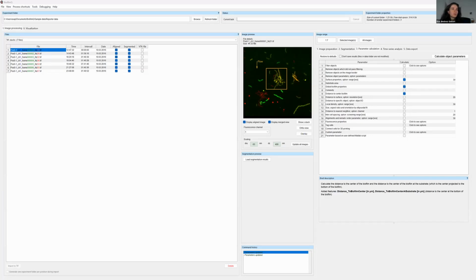You can, of course, do some deconvolution. There's software for that, for example Huygens, where you can counteract imaging artifacts of your microscope. And there are also pipelines with neural networks where you can try to get rid of noise that might prevent you from doing a good single cell segmentation, with CARE, for example. But there's definitely a limit. It depends strongly on your data.